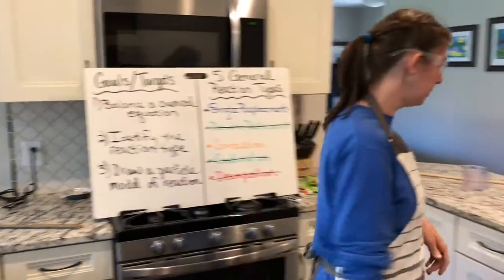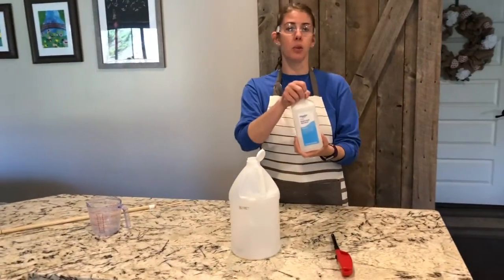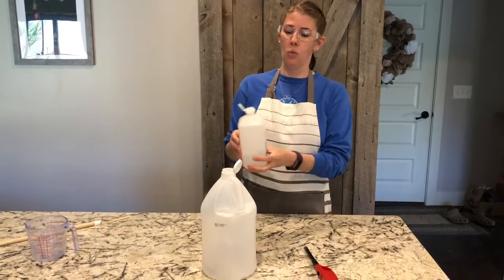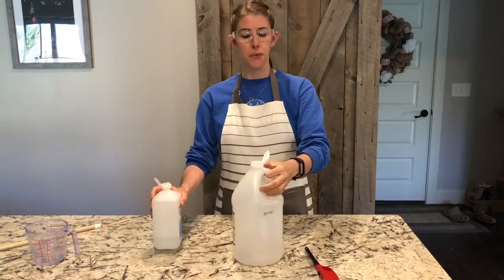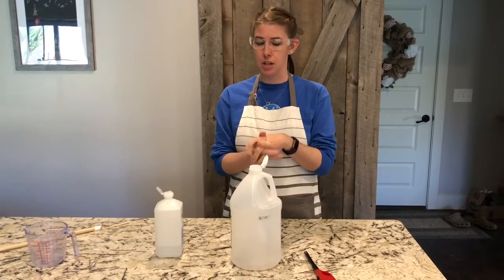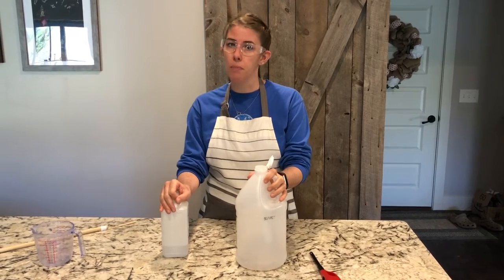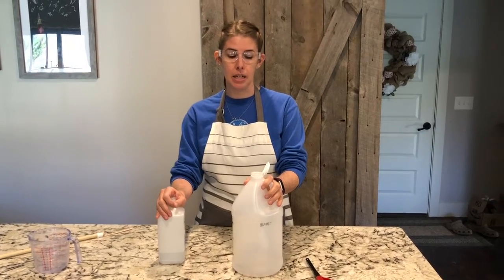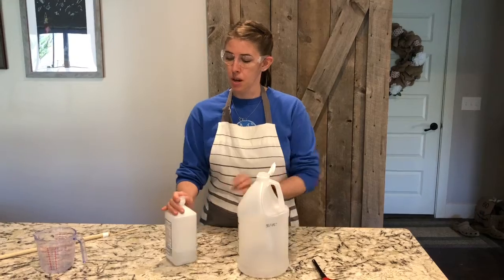Okay, so come on over here, and I have 70% isopropyl alcohol, also known as propanol, and this is just an empty vinegar container. A few safety measures that I've taken into account to do this demonstration here. I've seen teachers do this demonstration with methanol. That is much more flammable and dangerous to use than isopropyl alcohol would be.